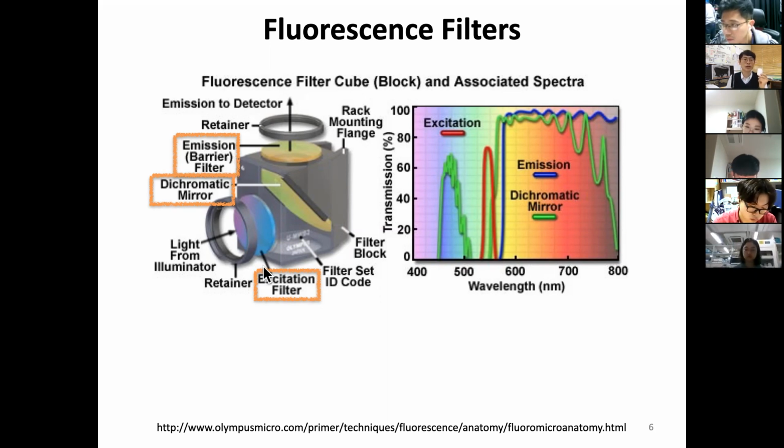So just don't believe what you buy from the vendor, and just don't trust. You have to watch their specification. In this case, the spectrum. So I'm going to go through a little bit. This is a little bit hard, but it would be great if you understand this.